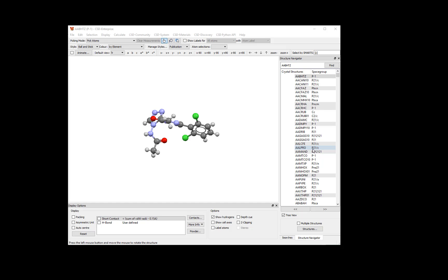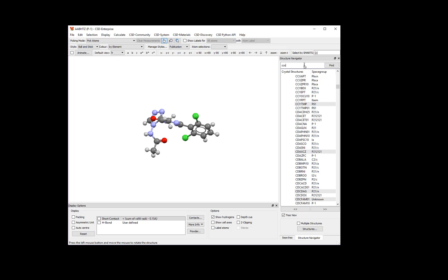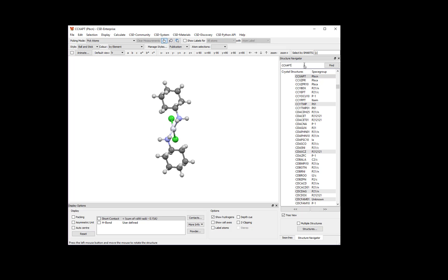For this example, we'll be looking at a cisplatin derivative. To bring up this molecule in the viewer, type its refcode in the Structure Navigator box. The refcode we'll be using is CCXAPT. Once you type the refcode in the box, the molecule will display in the Mercury viewer window.